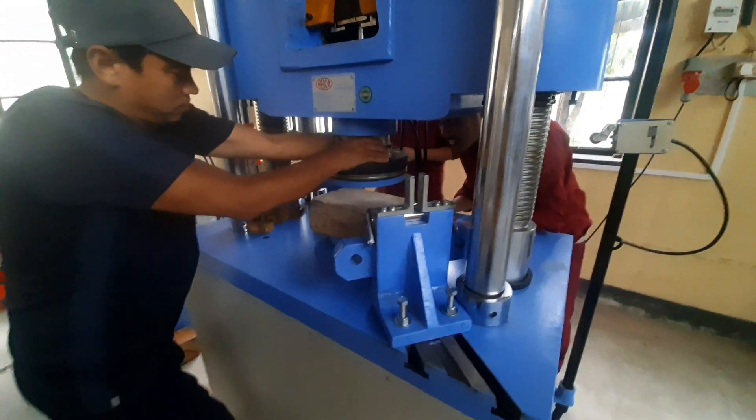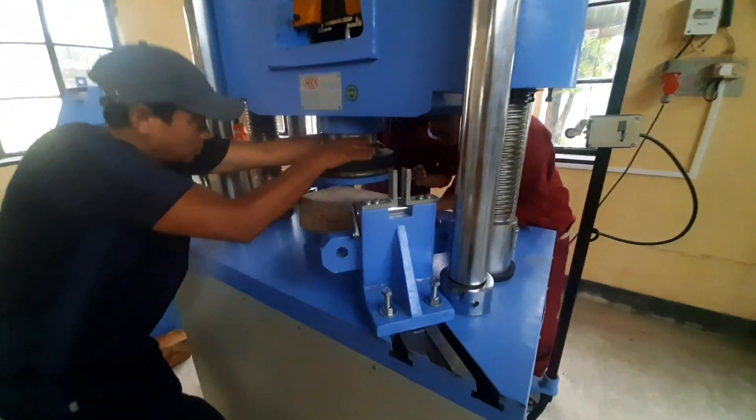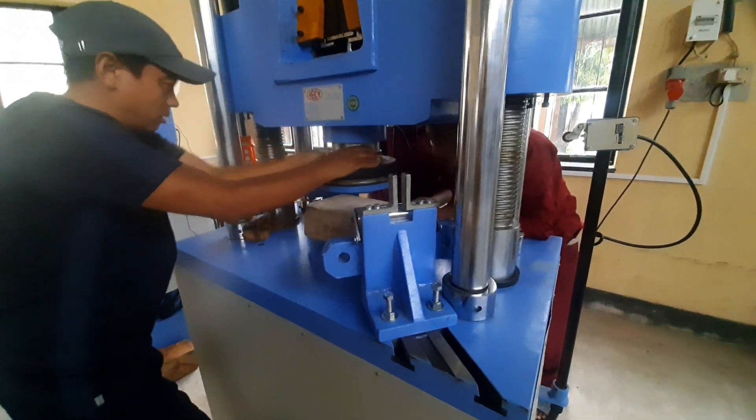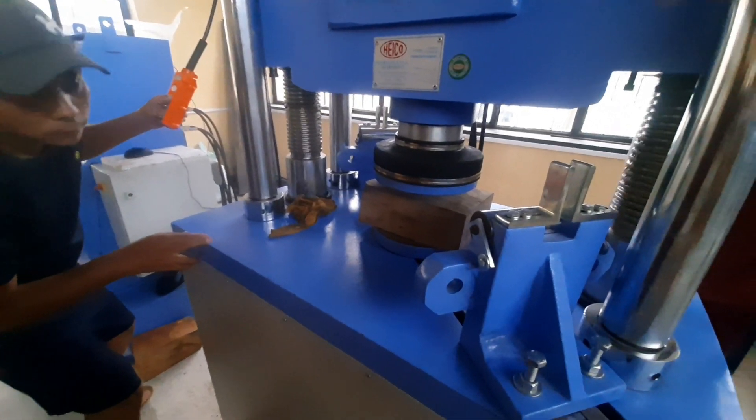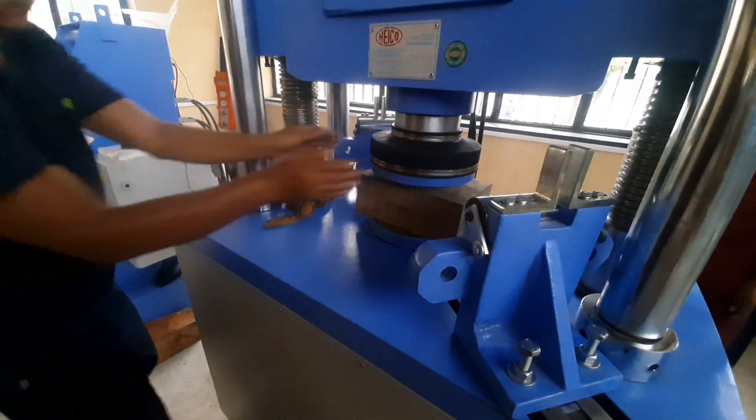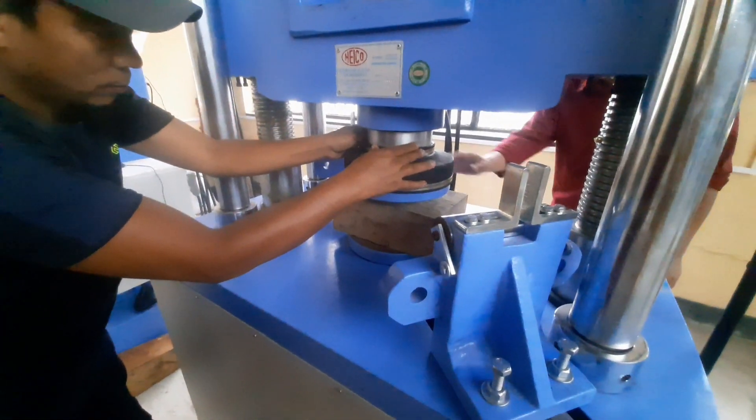While carrying out the hardness test, these are the precautions that need to be kept in mind. While removing and fixing the compression attachment, we have to be extra careful. Measure the indenter carefully and avoid edge effects.